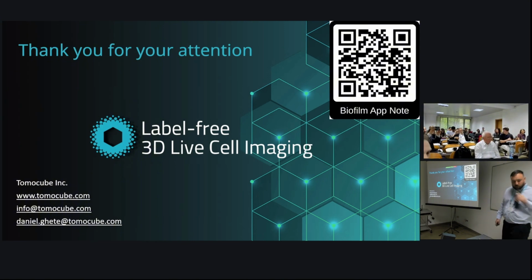I have a question. You mentioned that it's feasible to image alive and fixed cells or tissues. Do you see a difference in the acquisition and so the resolution that you get out of it at the end once the tissue is fixed?